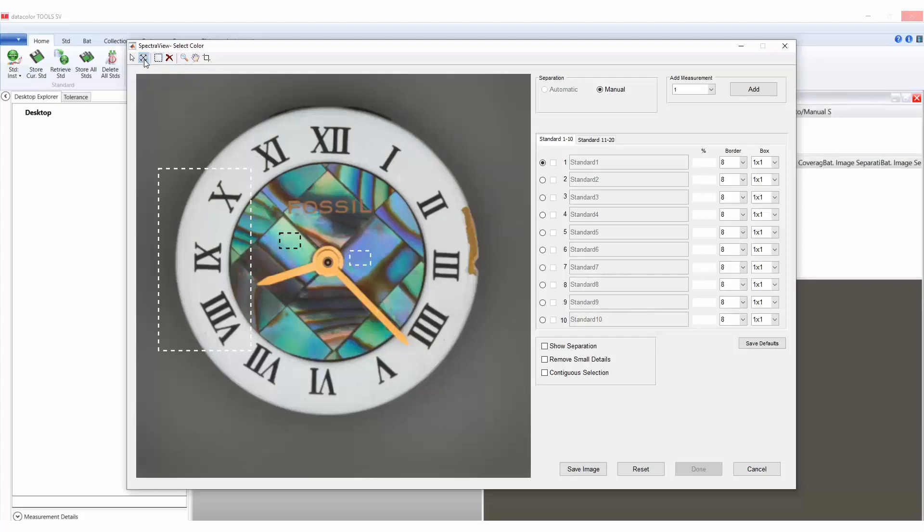Choose the select all icon at the top of the color measurement window. The icon will change from a plus sign to a hand. Select the first regional selection — note the dotted line is replaced with a solid line and the percent coverage is now visible. Repeat this step for the second regional selection.